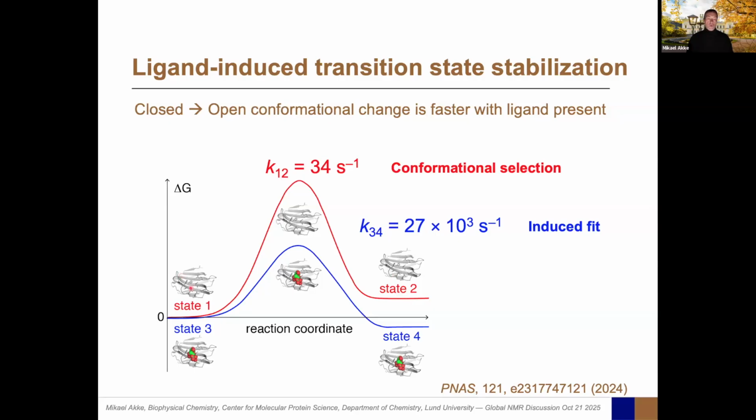Well, from what I showed you of the ground state, that's just a backbone trace. And you should think about all the different side chains that coordinate the ligand. In the high energy state here, they are pretty much aligned in the same way as when it's bound to the ligand.